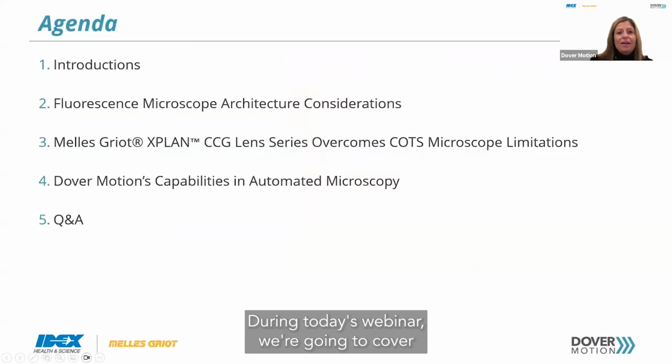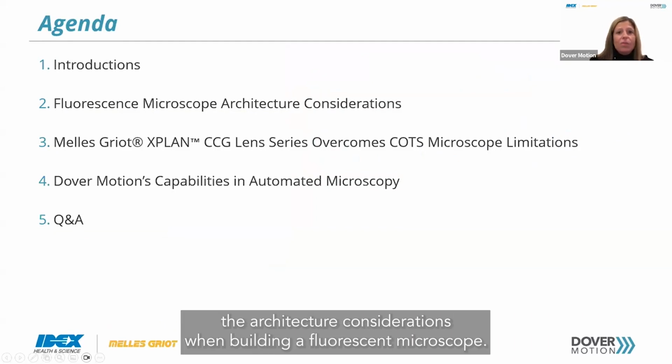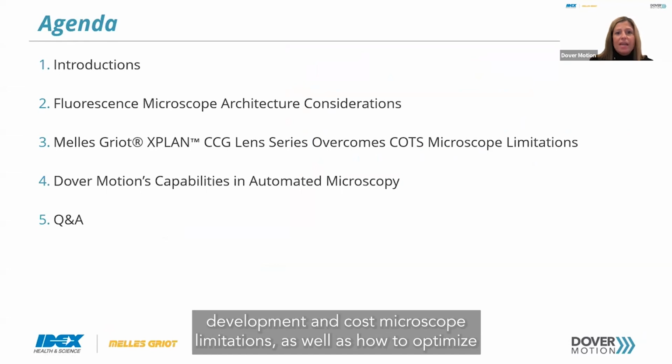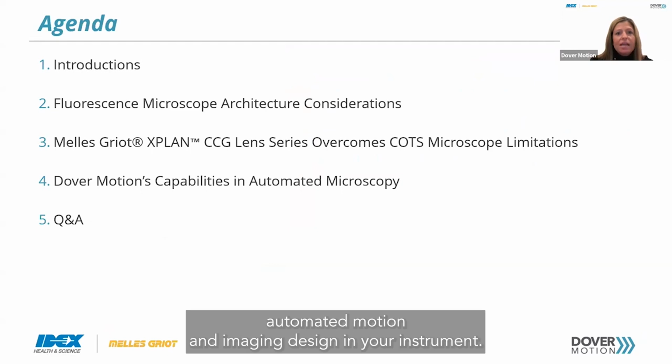During today's webinar, we're going to cover the architecture considerations when building a fluorescent microscope, the challenges of microscopy instrument development and COTS microscope limitations, as well as how to optimize automated motion and imaging design in your instrument.